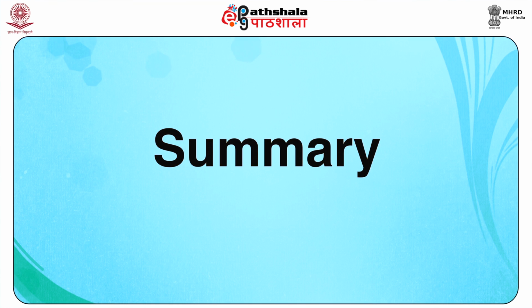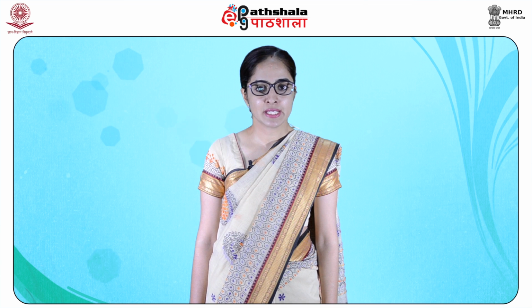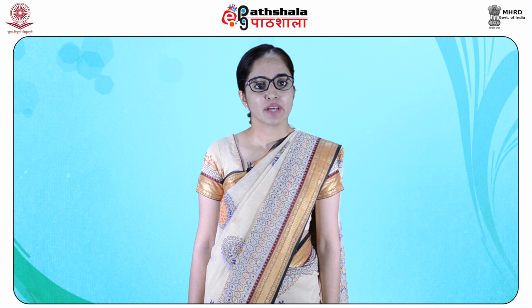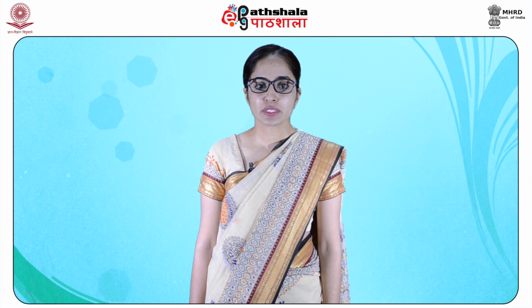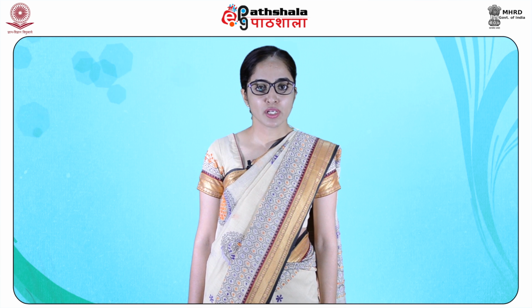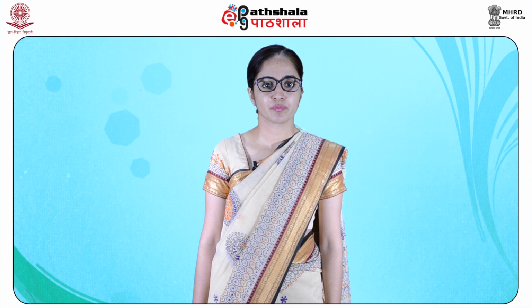Now, students, let us summarize this module. The intensity of the peaks in case of simple splitting is according to Pascal's triangle. Various factors like non-equivalent protons, close chemical shifts of coupled protons and presence of a chiral center in a molecule lead to complexity in an NMR spectra.